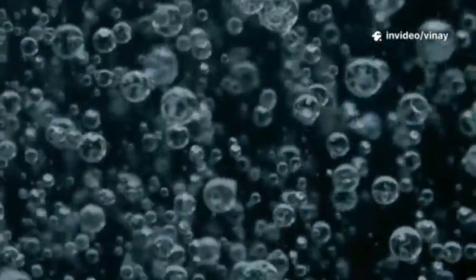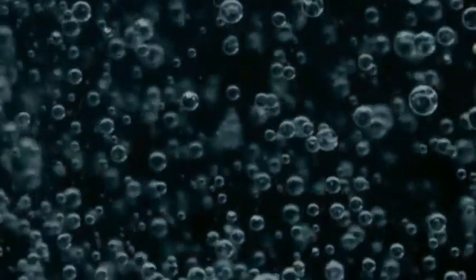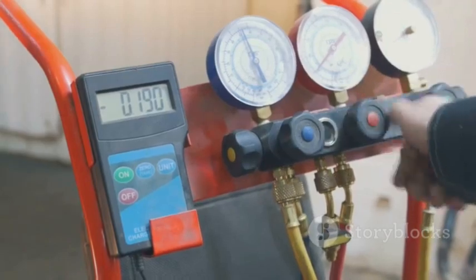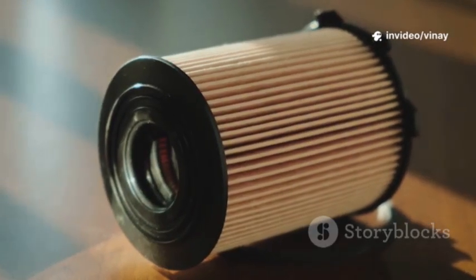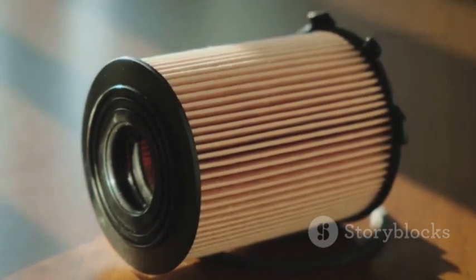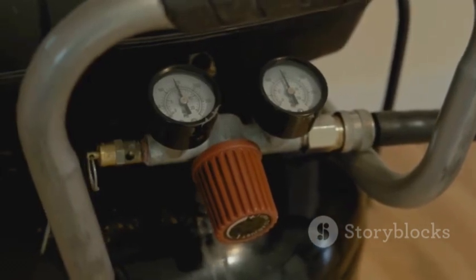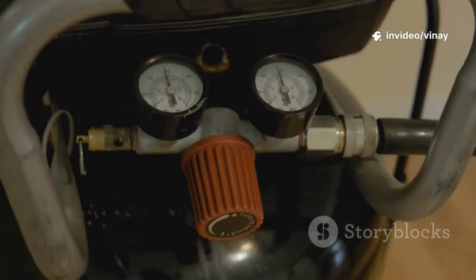The exact moment that the gas pressure pushes the liquid out of that largest pore, and a steady stream of bubbles appears on the other side, is called the bubble point. We measure the pressure at that exact moment. Every filter model has a specific minimum bubble point value that it must meet, which is determined by the manufacturer. For example, the manufacturer might say that for this filter to be good, its bubble point must be at least 50 psi, or pounds per square inch.